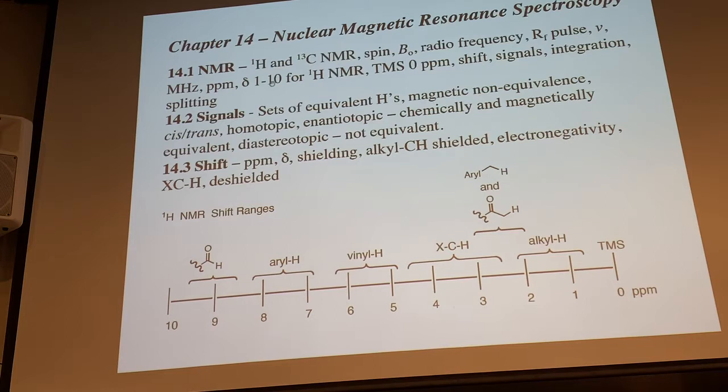But what we look for here is a shift range, we call. It's a kind of ppm scale, or parts per million, of the Hertz numbers relative to the megahertz of the instrument. Okay. And I'll show you how that works. The frequency applied here in the RF pulse is the frequency number nu right here, and it's in the megahertz range, which is in that radio wavelength range for the radiation. So we'll look at proton NMR mainly, and that will have a shift range of 1 to 10 ppm.